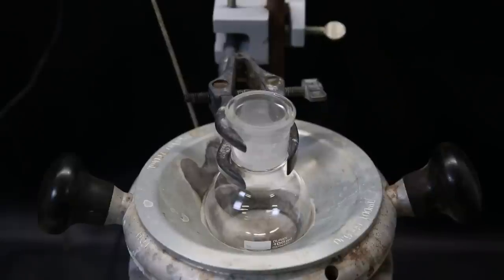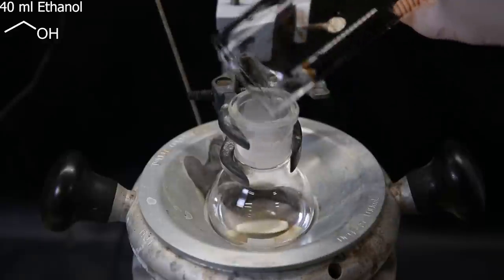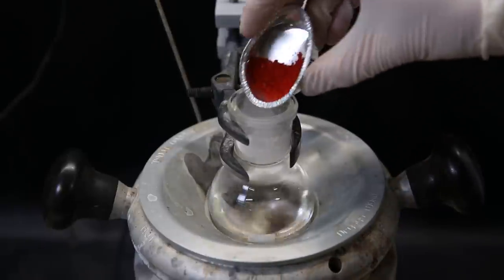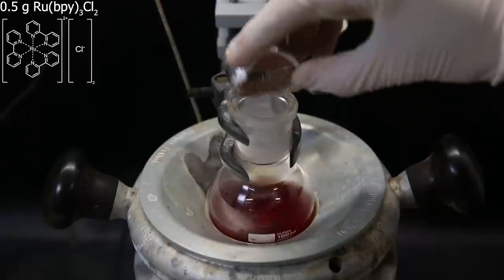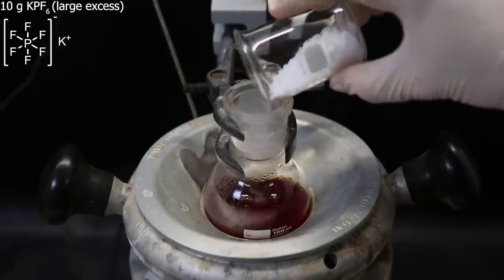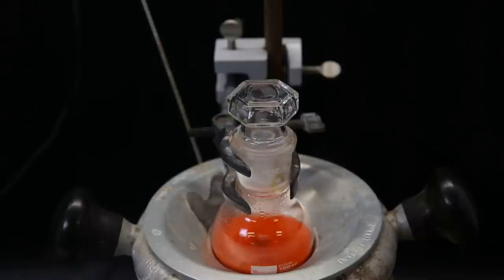Now I will prepare the second catalyst. So I set up a new flask in a heating mantle and add in a stir bar. I add 40 ml of ethanol and then add in 0.5 grams of tris(bipyridine)ruthenium(II) chloride that I made in a previous video. I then add in 10 grams of potassium hexafluorophosphate, which is in a large excess. I then heat it to 40°C and leave it for 30 minutes.